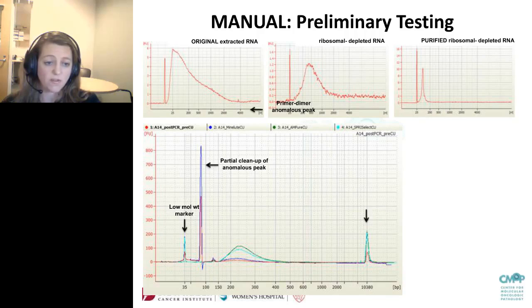Most of our samples are 5 to 10 years in age, so the RNA has largely degraded, and you get a much smaller fragmentation peak for the RNA that remains. Sometimes it's challenging to generate a RIN number, but the RIN numbers range from about 2.4 up to 4. 4 is the best case scenario for some of these samples.